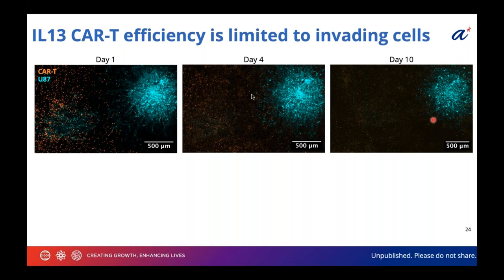And then a couple other questions regarding the organiX platform. How easy or difficult is it to remove the tissues and cells from the organiX devices? It's pretty easy depending on what you want to do.